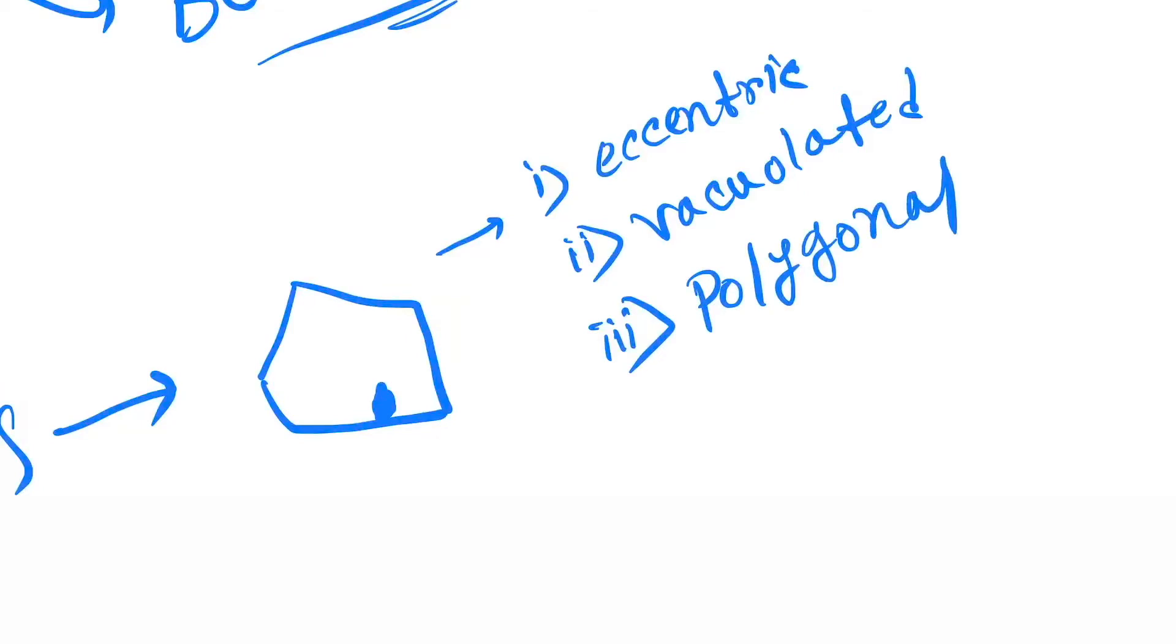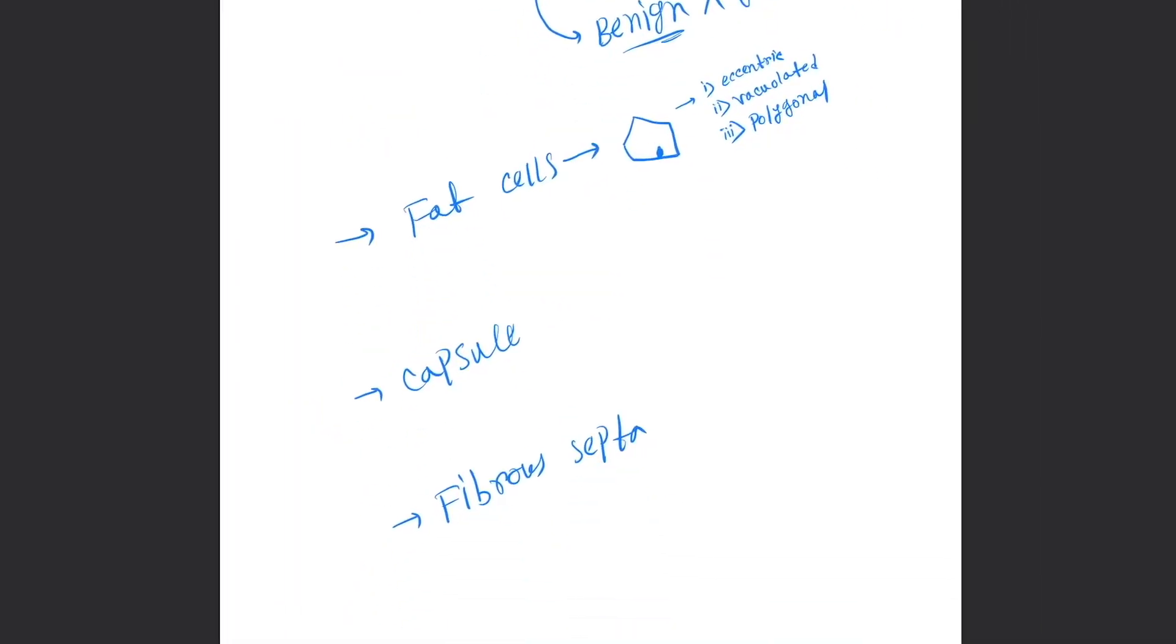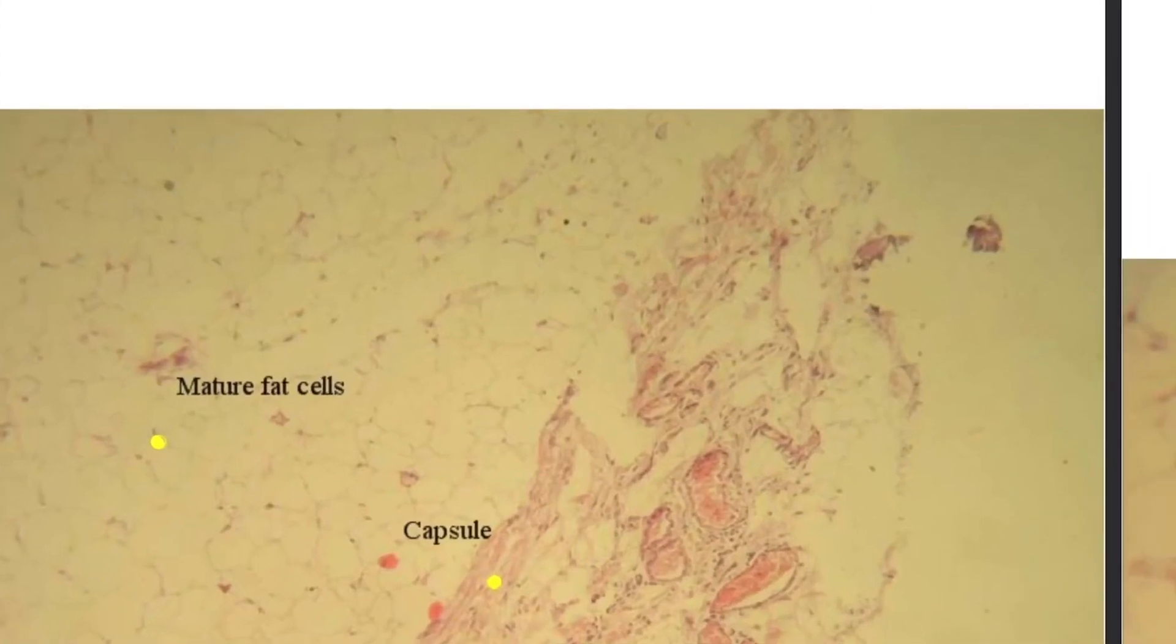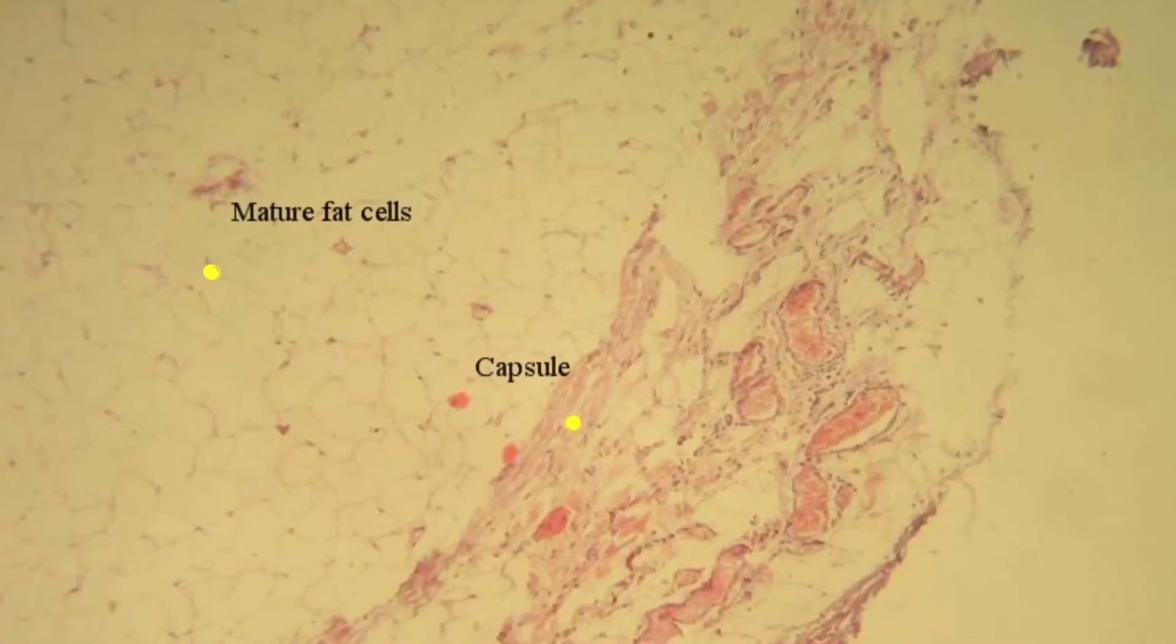Now see the histopathological slide. Here you can see the mature fat cells. These are the fat cells which are polygonal in nature.